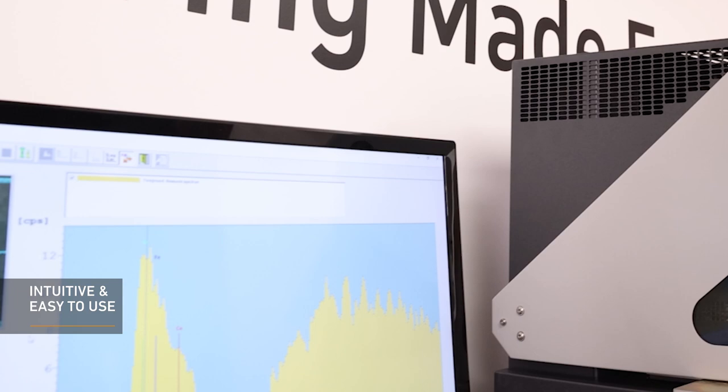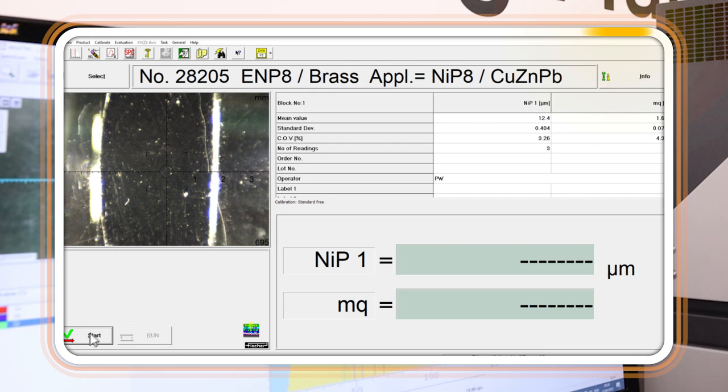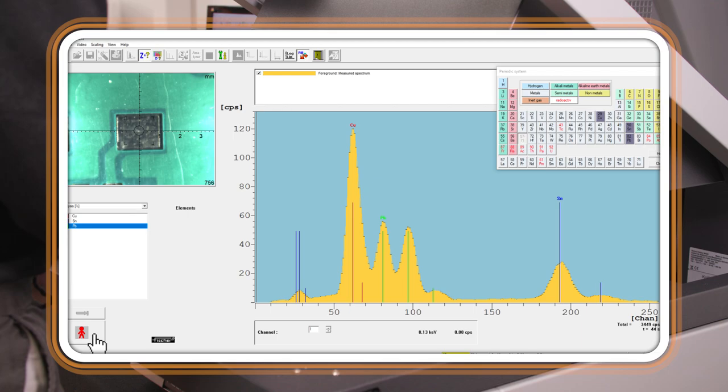The instrument has easy-to-use software, so users can be up and running quickly, regardless of experience. Clear measurement data is gathered and stored, enabling powerful reports laid out in a simple way.